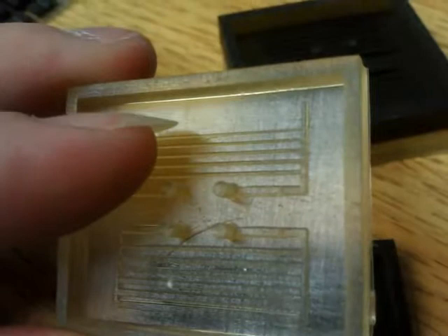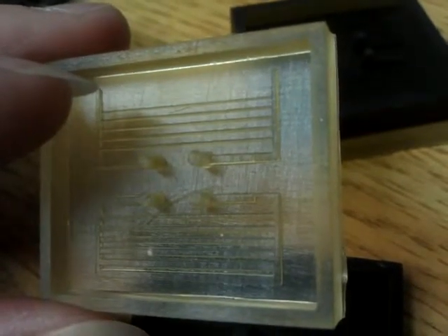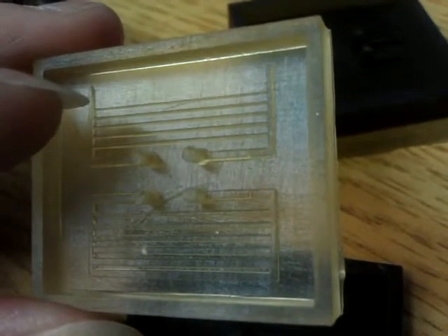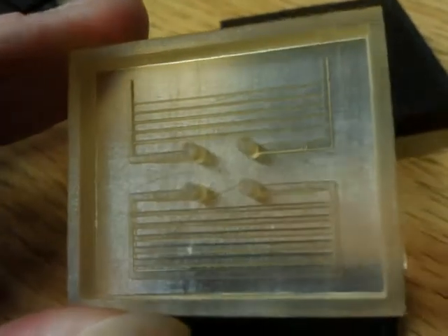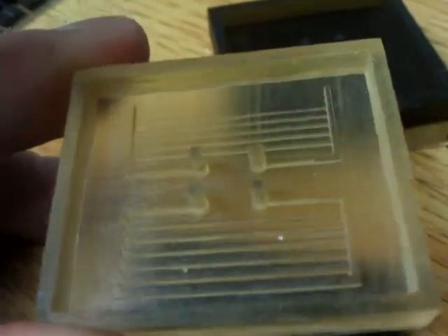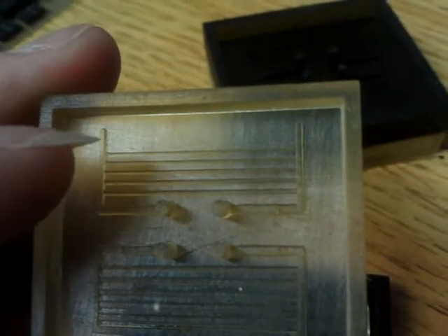We can see here that the channels are missing — one, two, three channels: the 50 micron channel, 100 micron channel, and 150 micron channel. Why did this happen? I suspect that the curing time was too short — the exposure from the projector light was too short and didn't give enough time to the material to start to polymerize.